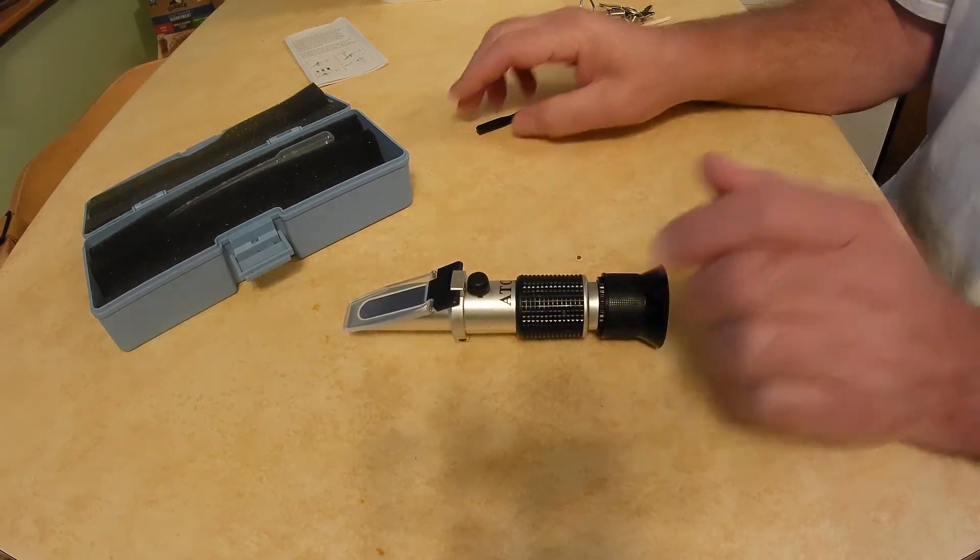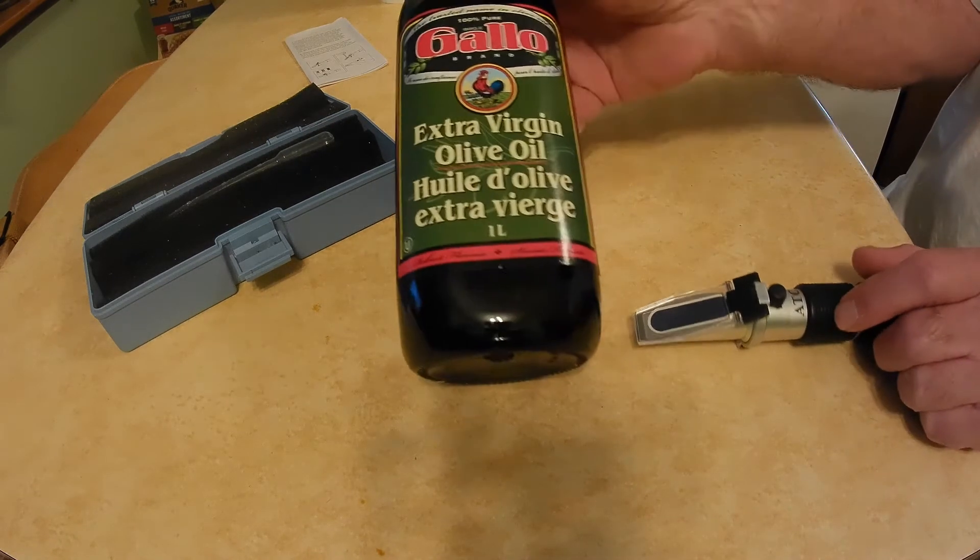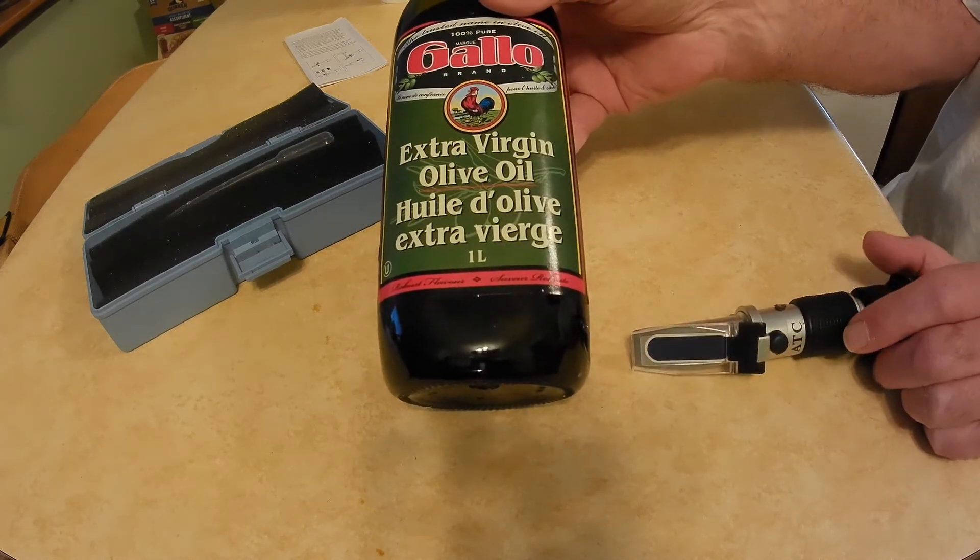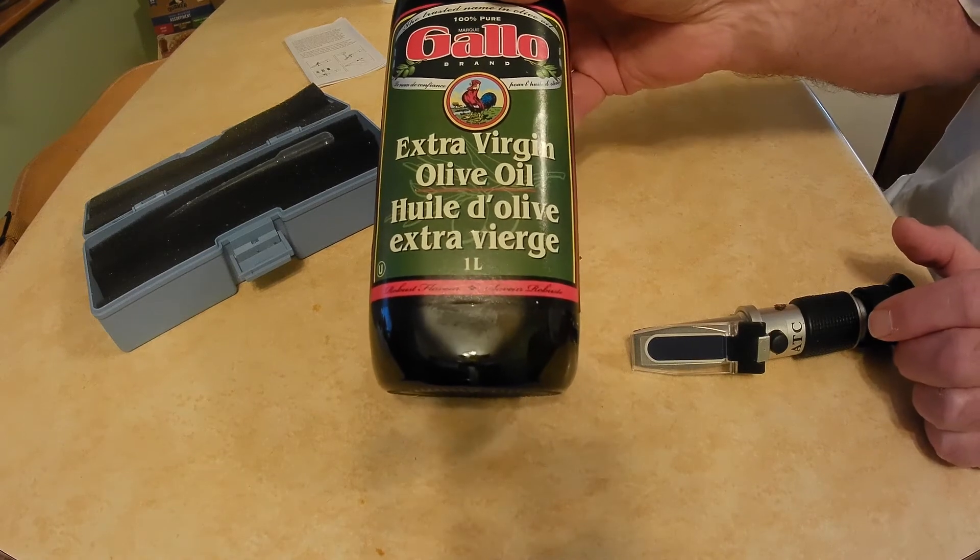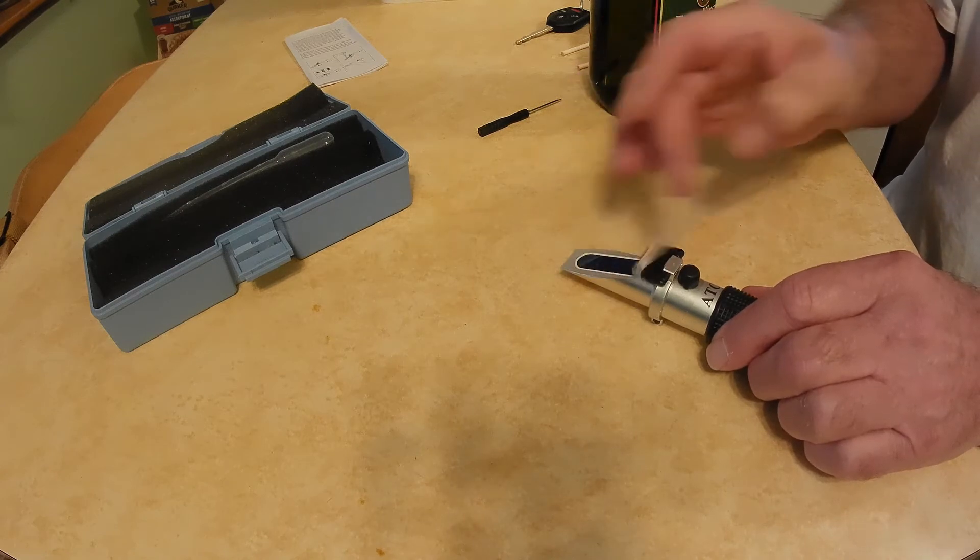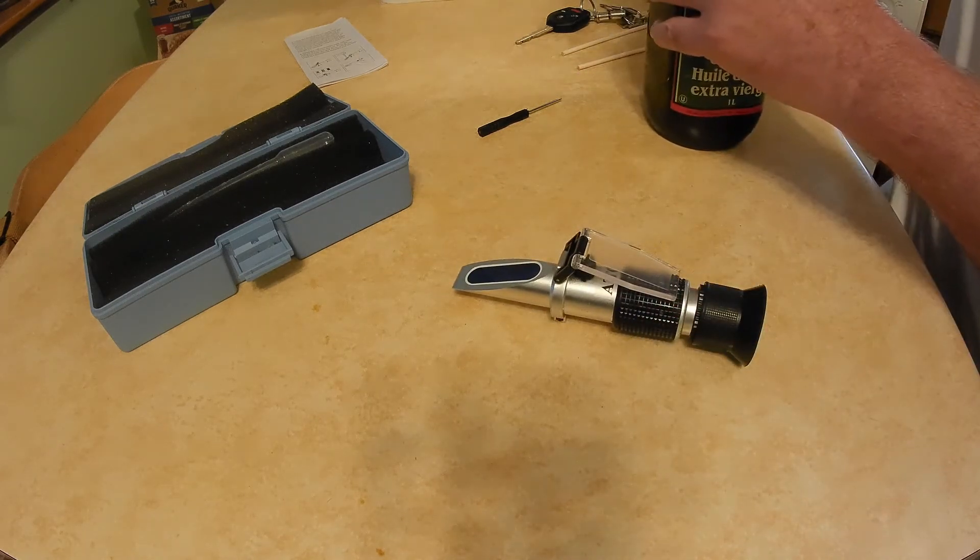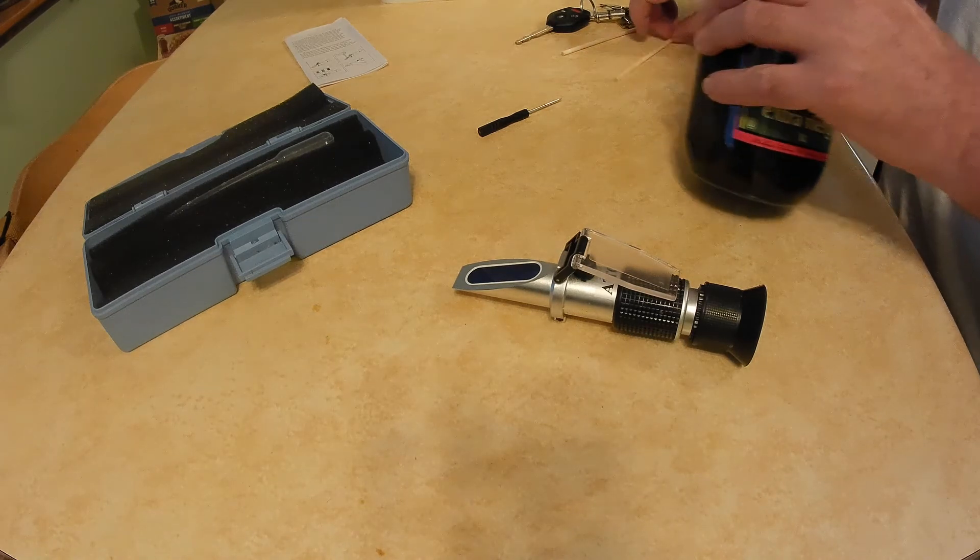So in order to calibrate a honey refractometer, all you need is something out of your kitchen cupboard called extra virgin olive oil. So let's have a look at this and see if this is true or not.